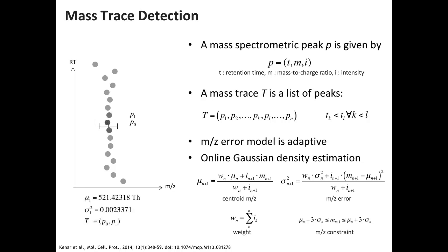Now we can start adjusting this error. So this error is going down because we see, no, they're not 1 ppm apart. They're just 0.1 ppm apart because the mass accuracy is very high. We have high intensity peaks there. They are well picked, and that helps us to figure out how far we can go, because we just keep on adding these peaks until back here, when these peaks start scattering around, we say these are no longer part of our mass trace, and we have an accurate estimate of the mass error within this mass trace that is much better than a nominal instrument accuracy.